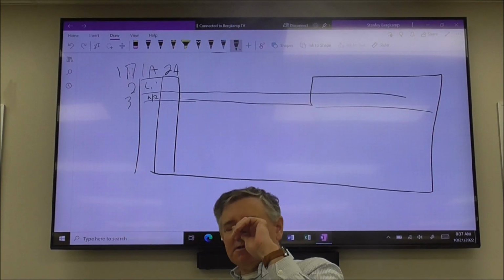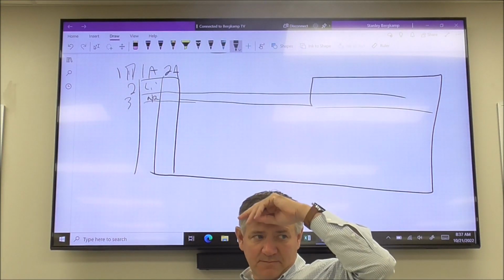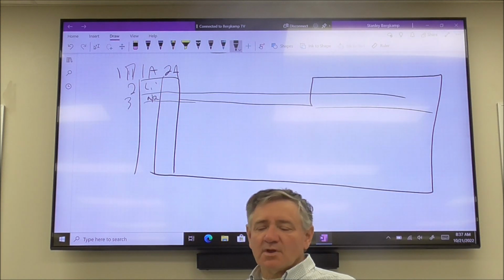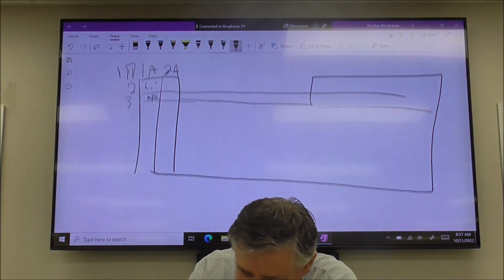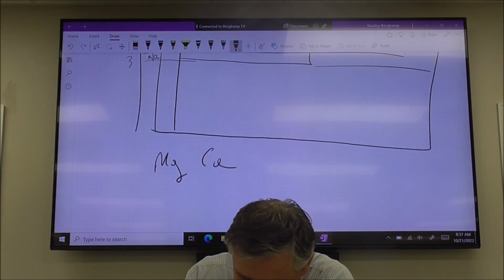Okay, so here's hopefully what you saw when you have that precipitate chart filled out. Let's look at the 2 extremes. When you look at your chart, compare the magnesium, the calcium, the strontium, and the barium.